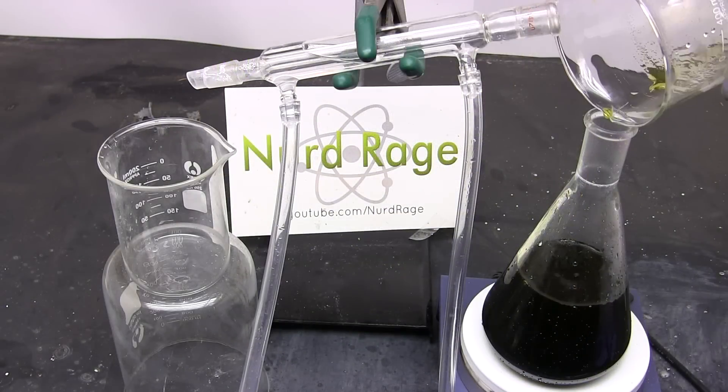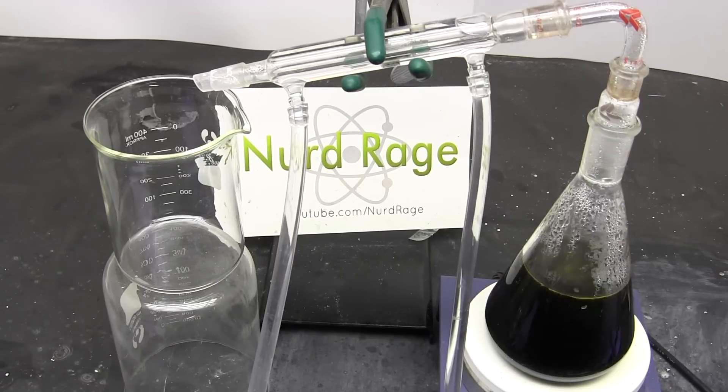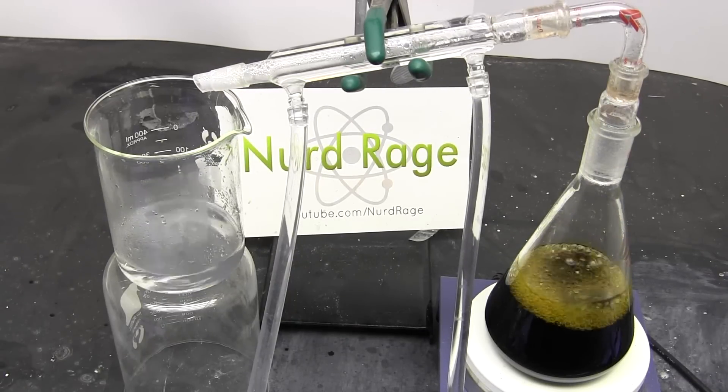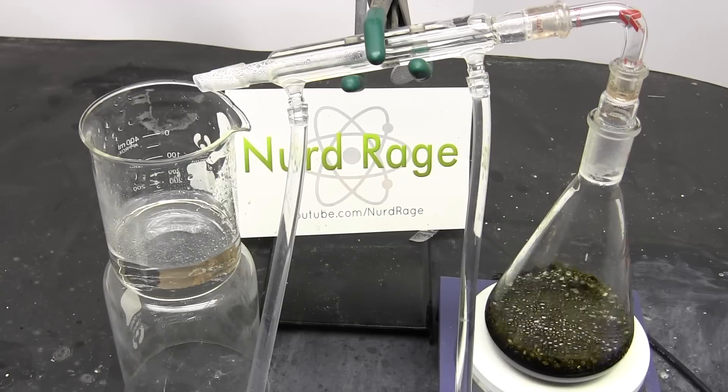Now I'm getting the filtrate and distilling off the water and hydrochloric acid. This step is actually optional but I'm doing it because I wanted to weigh how much ferric and copper chlorides I had. You don't actually need to do this part and can go right to adding copper.